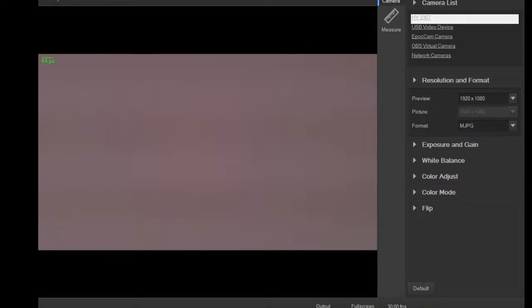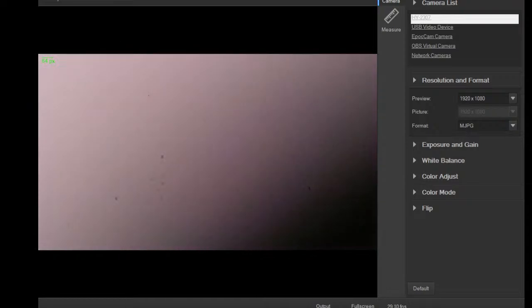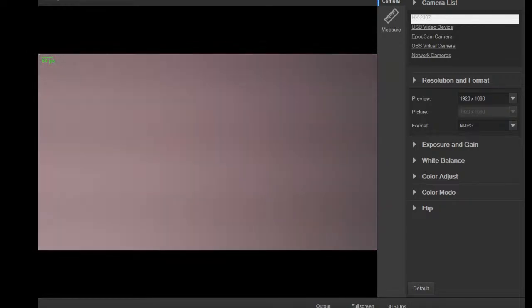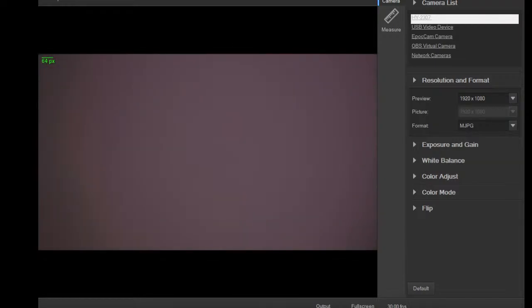They're more opaque, so they may not be good candidates for the compound scope. Let's see. Damn, they are a little ball, so they're rolling. This is a challenge. Let's see how that works. See what that looks like. Let's go to low power because they're big. Oh yeah, it's taking up the whole screen here.